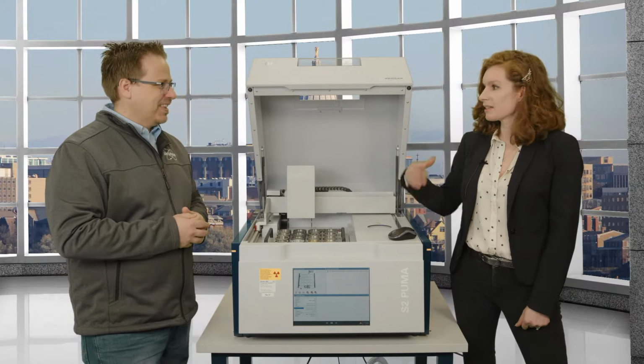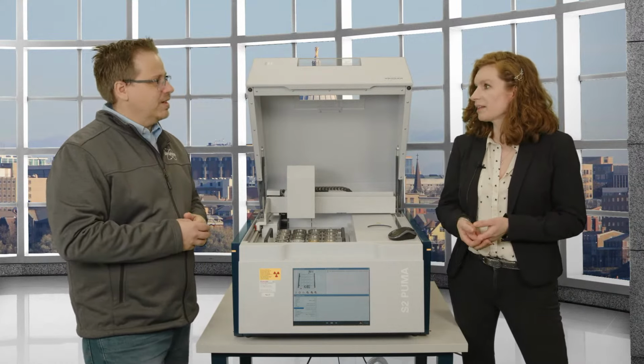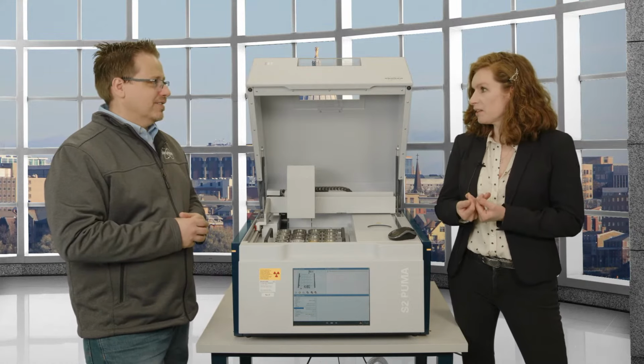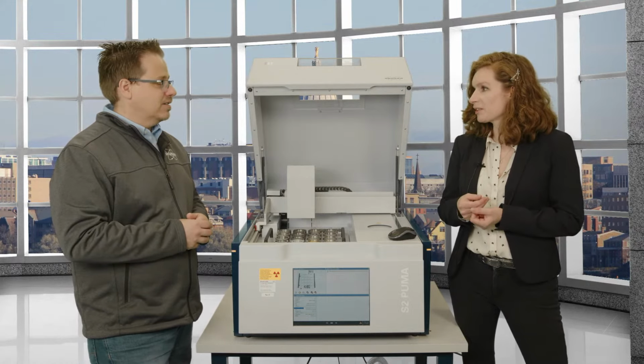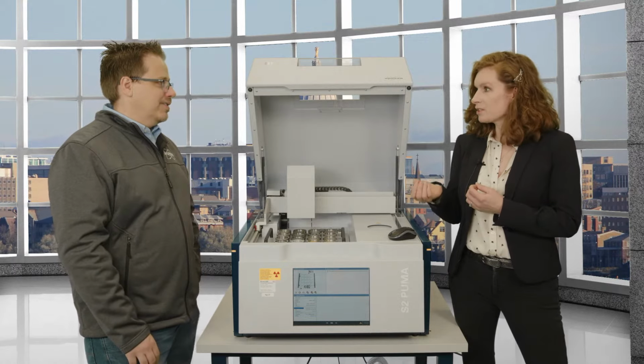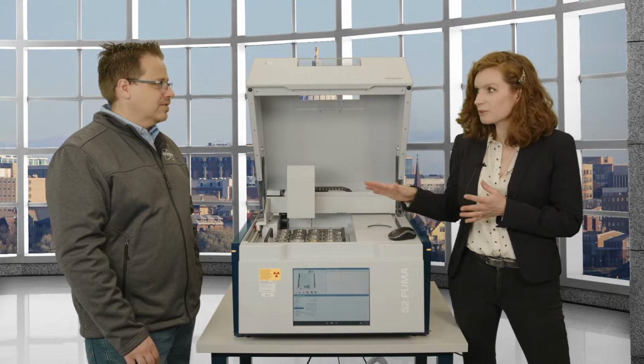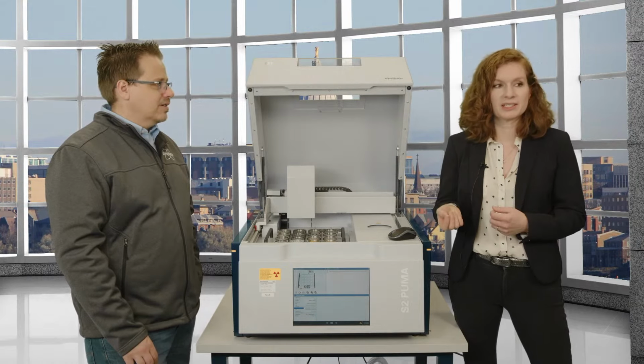I also brought it because one of the newer applications we do is going into the food and feed market, like looking at feed for animals, right? And so you can measure this and you can see what's in there. And I think for industry that's interesting. And I think what's interesting also is even with the cookies, without sample prep, without anything, we could already see some things.